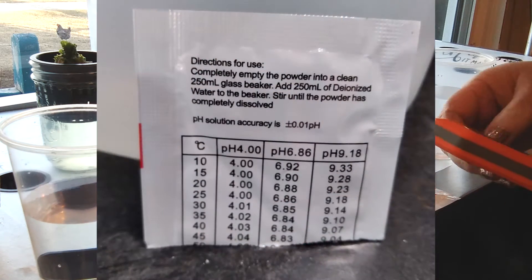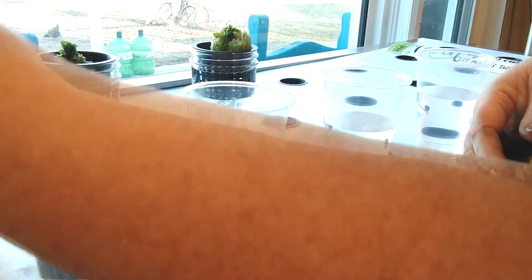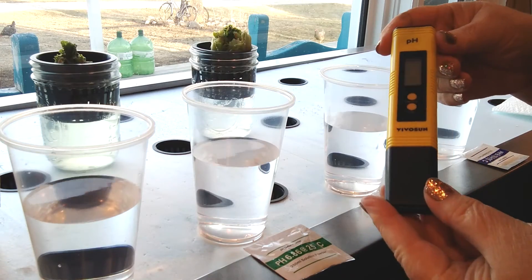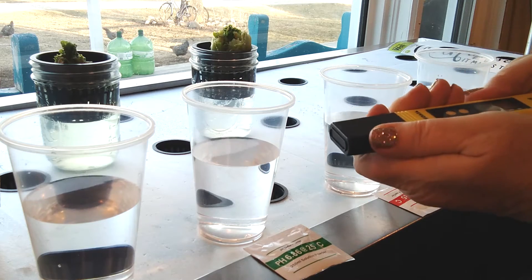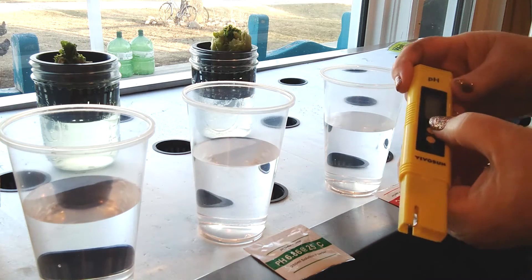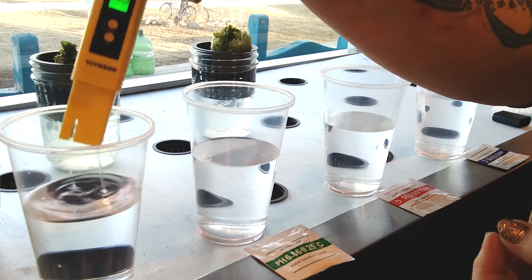According to our instructions, our water needs to be at 25 degrees Celsius, which is approximately 77 degrees Fahrenheit. It's not that warm here today, so I'm going to go off of the temperature we have right now, which is about 20 degrees Celsius. What's really nice is on the back of the packets they do have a conversion chart — at 20 degrees Celsius that's about 68 degrees Fahrenheit — so we're going to go with the 20 degrees Celsius measurement.